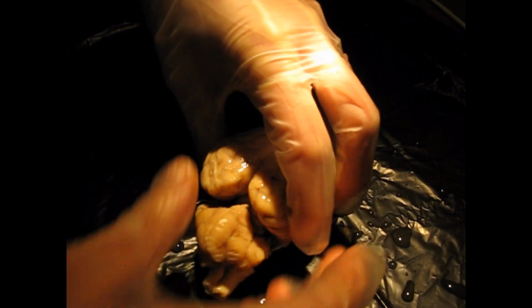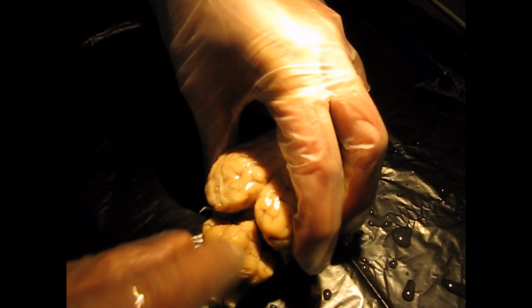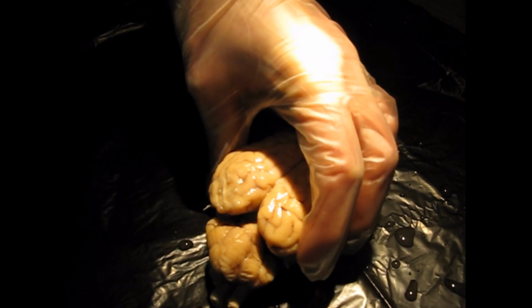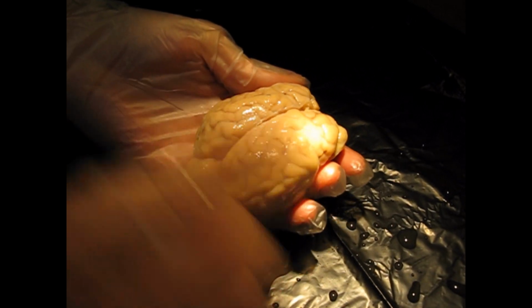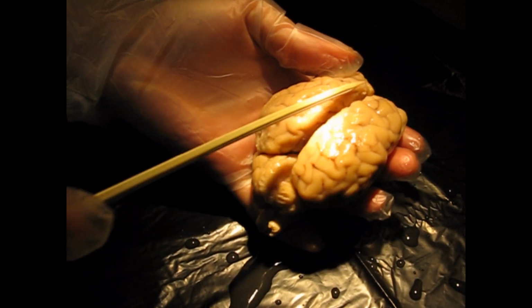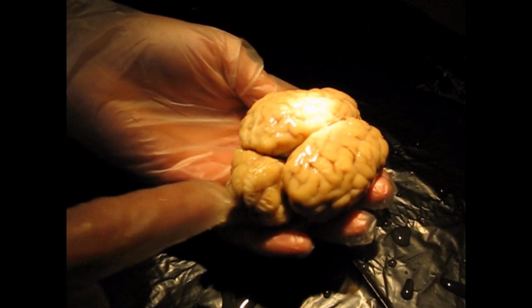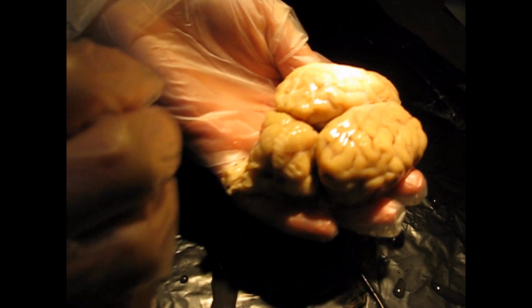This here is our horizontal cerebral fissure separating the cerebrum and the cerebellum, which is this structure right here. So, get my probe. So, occipital lobes, cerebellum. There's a main fissure separating the right and the left brain, and that's the longitudinal cerebral fissure right here. Okay. So I'm going to go ahead and look at the ventral aspect. So again, this is your cerebrum, cerebellum. This is part of the spinal cord, and very close to the medulla.